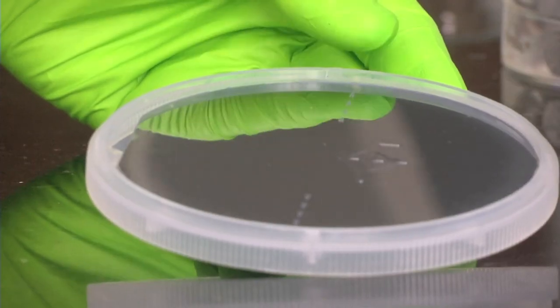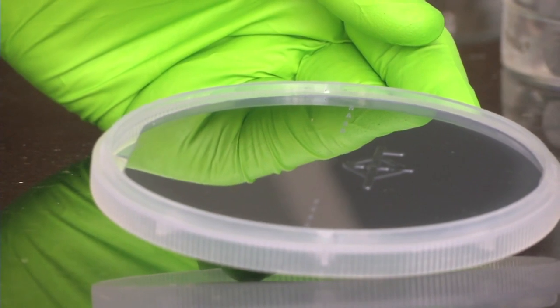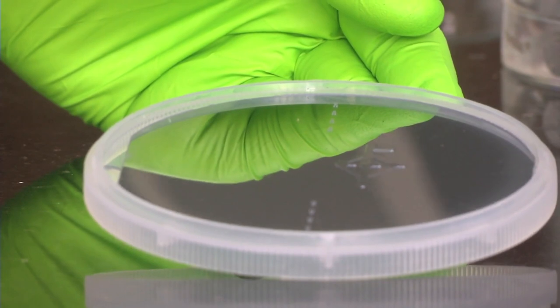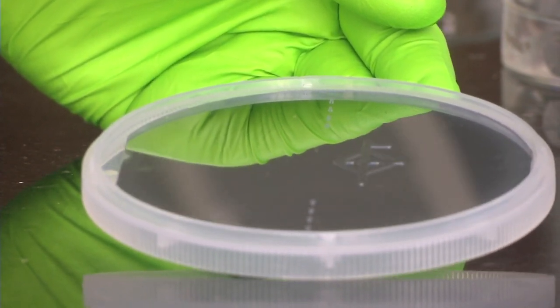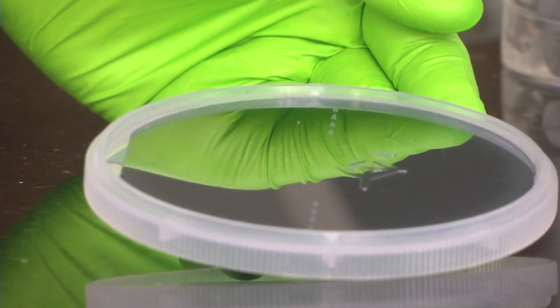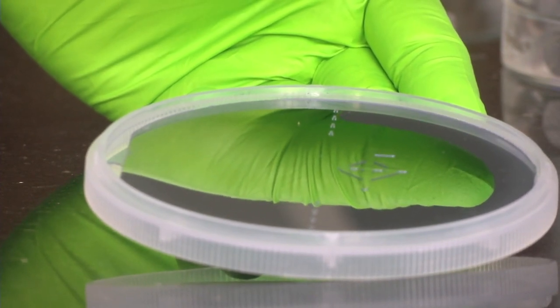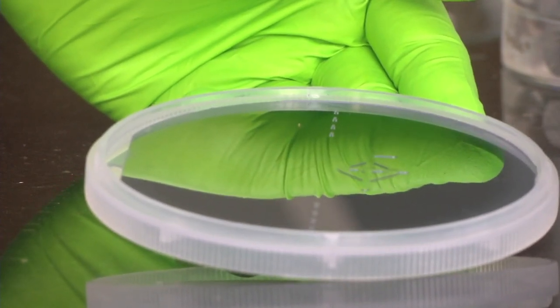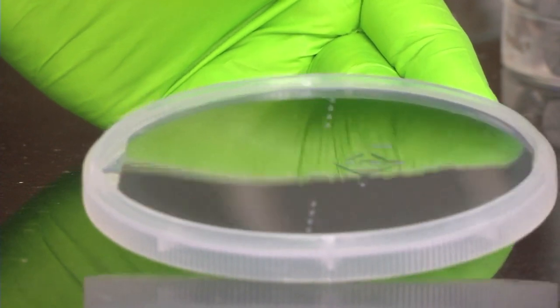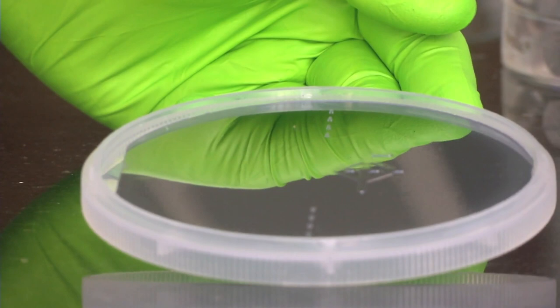These elevated structures will form as channels on the PDMS because the negative of this will form on the PDMS. On top of this we will pour PDMS. The silicon wafer is around 500 microns in thickness, then we have an oxide layer on top, then we do photolithography to pattern the surface. After developing we have the pattern formed, then we do deep reactive ion etching - wherever the pattern is not supposed to be, we etch away the silicon material so that only the pattern remains as an embossed structure. Then we remove the photoresist and we have the silicon master mould.